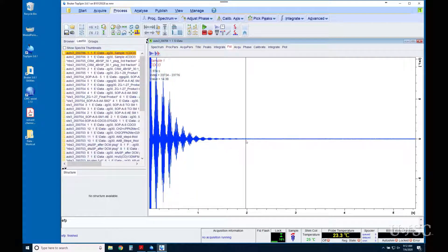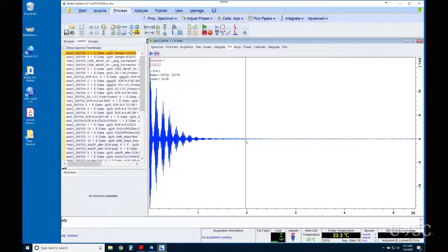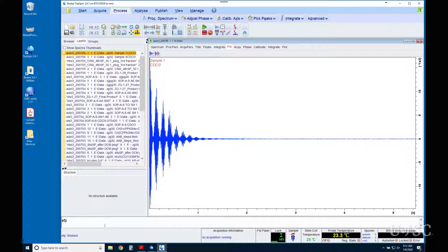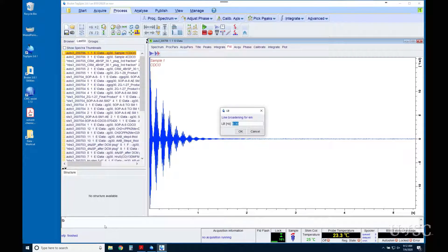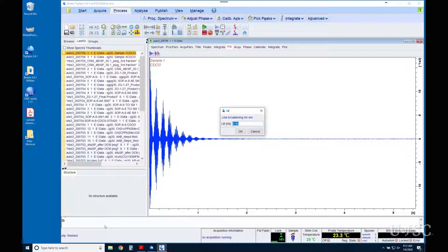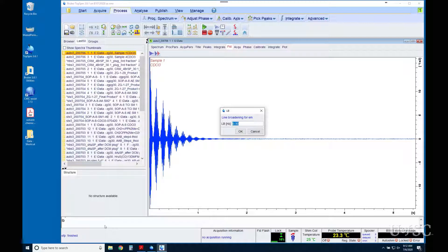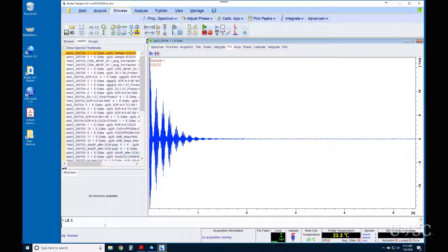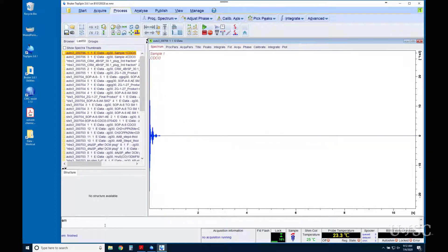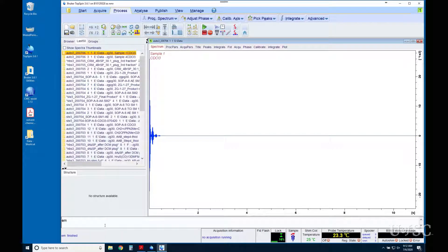The amount of line broadening is set by the LB parameter. The default value is usually pretty conservative, in favor of preserving resolution. If you increase the LB to say 3 Hz, the FID will be modified before the Fourier transfer like this. Note the squashing of the end of the FID but the front is mostly untouched.